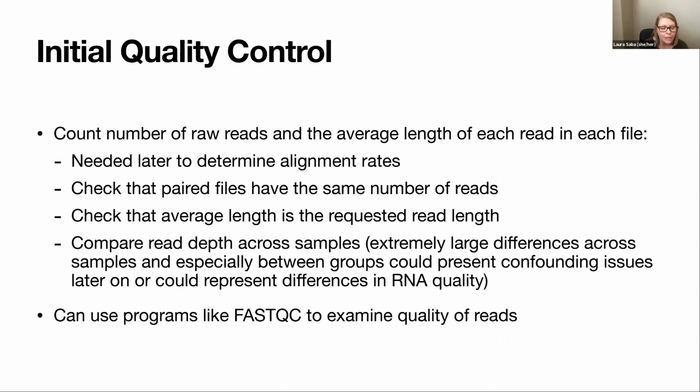When we have a particular sample that is much different as far as library size goes from the other samples, it tends to create problems down the road. And so we need to be made aware of that early on, to be able to track that sample throughout the quality control process. In general, if you get low read counts for a sample, much lower than everyone else, then usually something went wrong with that sample. And so that's reason for concern. So if everybody else has 30 million and you have 5 million for a single sample, that usually means that something's wrong, not that you should go ahead and use those 5 million reads, because they tend to look different than the other ones.